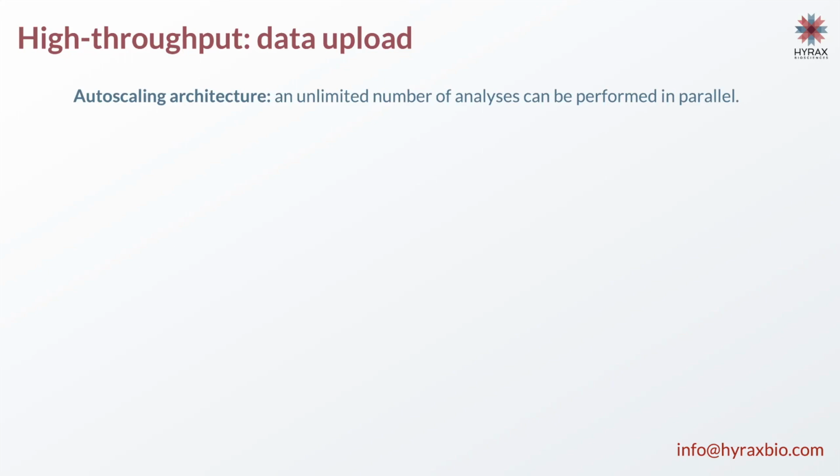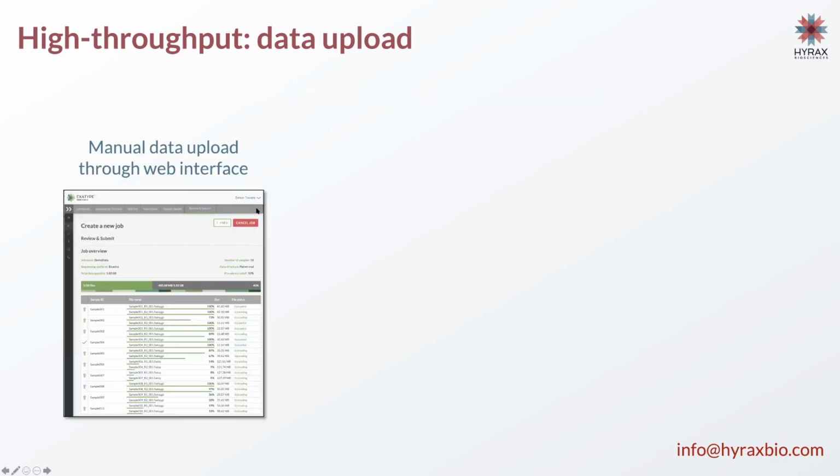So Exatype is fully deployed as a modern scaling solution. And as I hinted at earlier, it enables high throughput analysis, and really what we've done with this web-based solution is we've deployed a solution that enables high throughput analysis of SARS-CoV-2 data.